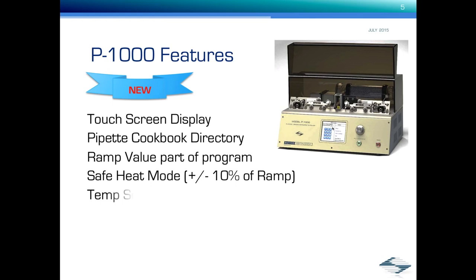Settings that are too low are also somewhat dangerous to the puller. You can cause a little bit of a meltdown on the nylon backing of the brass jaws, so you want to avoid that. I call that a Salvador Dali event, with the meltdown. There's a temperature sensor on the filament jaws, and that's another variable to look at when you're pulling your pipettes. Nice to know, say your pipettes are turning out perfect when the jaws are at 45 to 65 degrees centigrade.